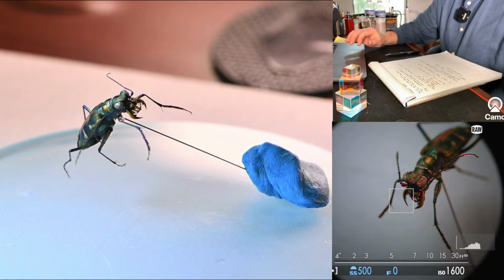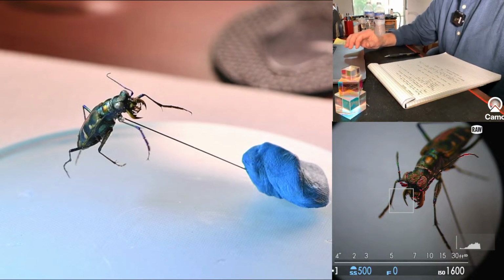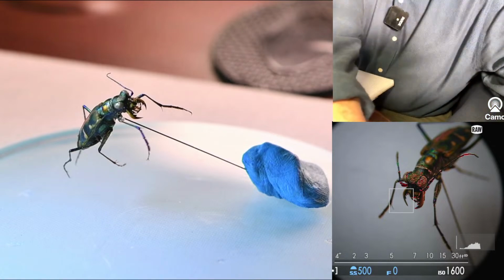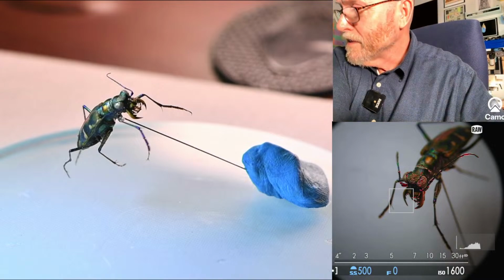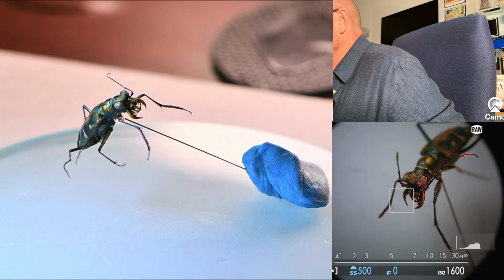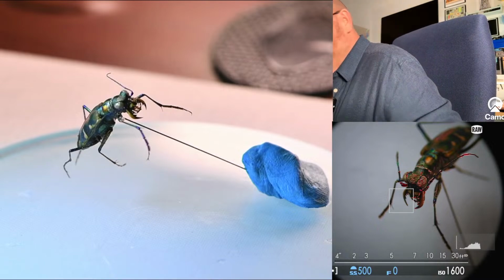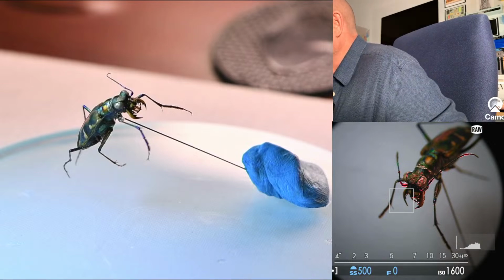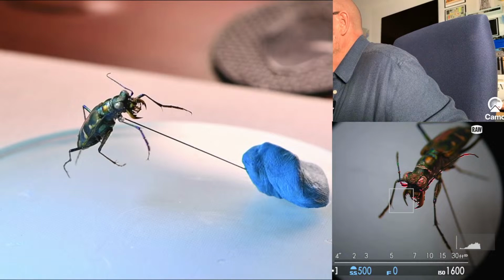One of them I may just turn off, but then again I may just show you the back of my head. Let me get that one set up a little differently. That was just to give you some context, because I'll be looking the other way. This is the microscope on the bottom right. Couldn't get a clean HDMI out. Don't know why. It's something to do with Fuji. I keep forgetting how to use the thing, but it's still a better picture, and that's at minimum magnification, so we'll pump that up a bit higher.